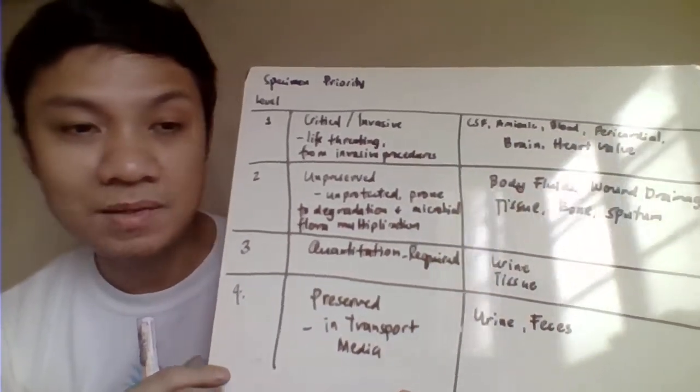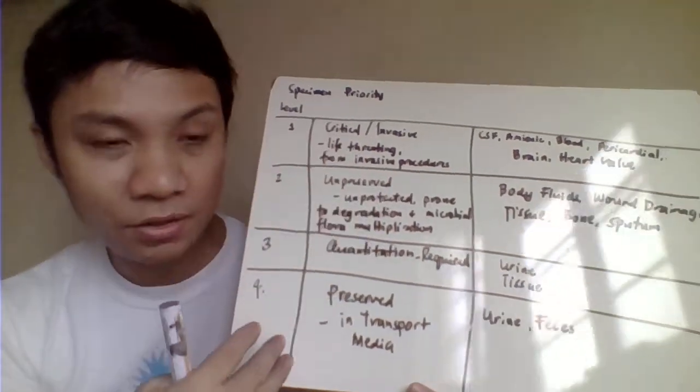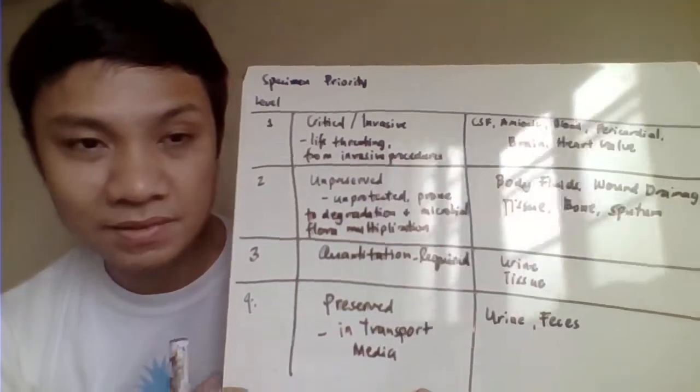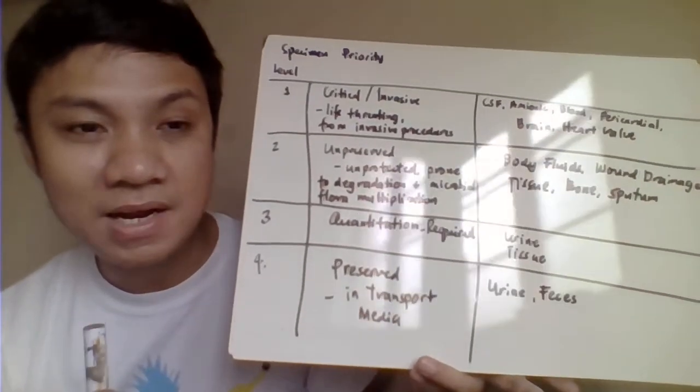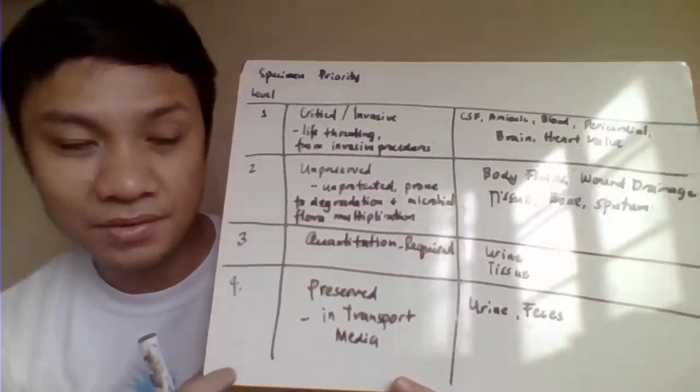But if you receive specimens with these levels, this serves as your basis for which one you are going to process first and which one can wait for processing, something like that.